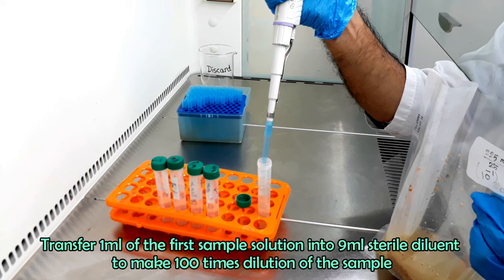Take a close look at 10 inverse 1 dilution plates. Both of trial 1 and trial 2 plates developed uncountable number of bacterial colonies. These are trial 1 and trial 2 plates obtained from 10 inverse 2 dilution, which also contain uncountable number of bacterial colonies. 10 inverse 3 dilution plates also contain uncountable number of bacterial colonies. Similarly, 10 inverse 4 dilution plates also contained very large number of bacterial colonies.